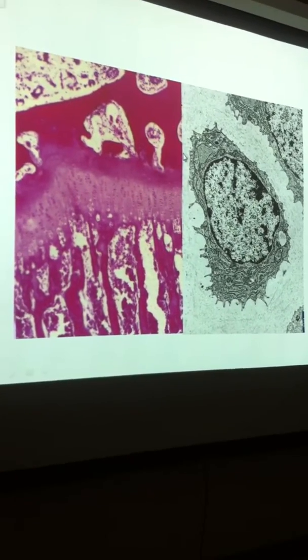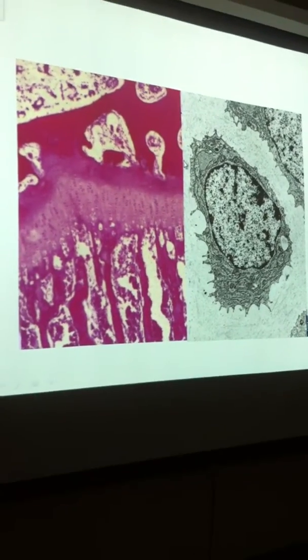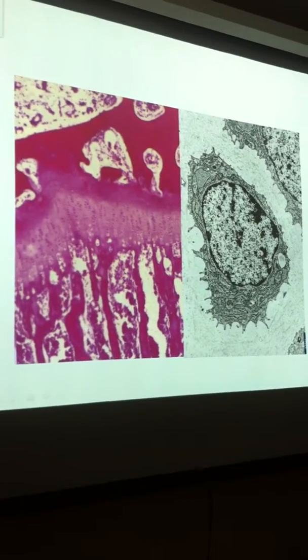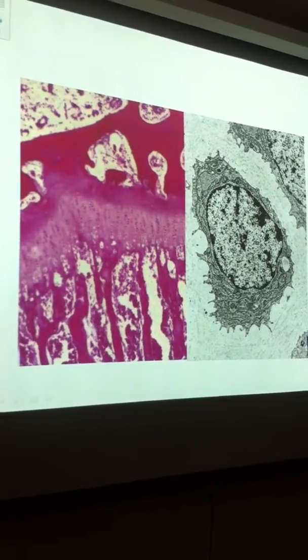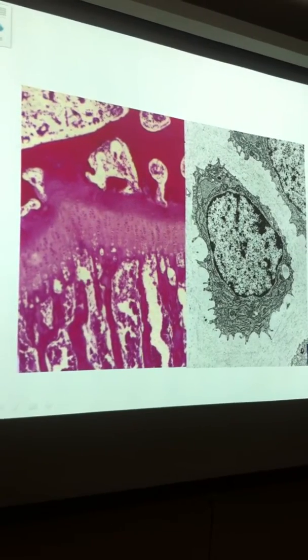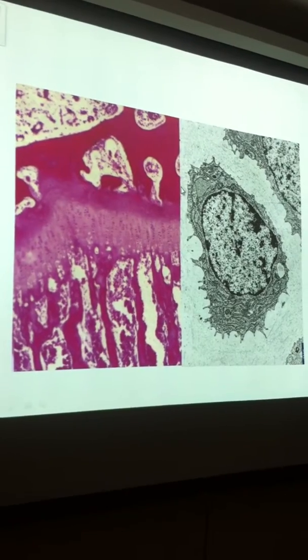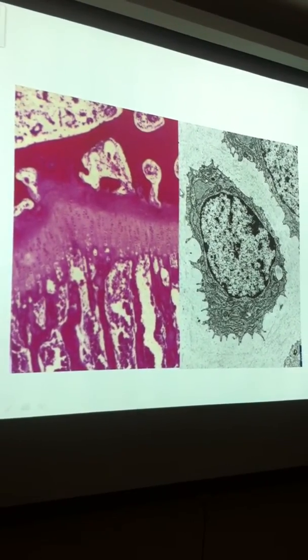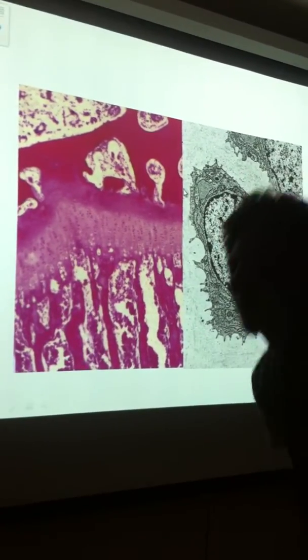So that is a chondrocyte. They look like kites. I remember when I was a student, I used that same book, more than 17 years ago. That same book, of course, it was a prior edition. And when I studied those, they looked to me like kites. And I never forgot. I said, when I have my own students, I'm going to teach them the kites.